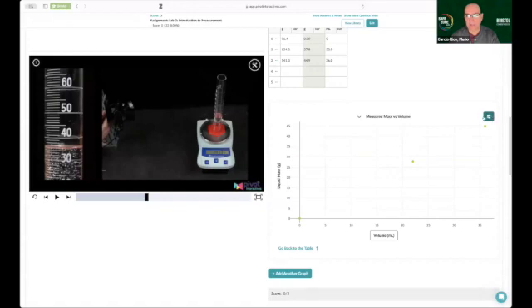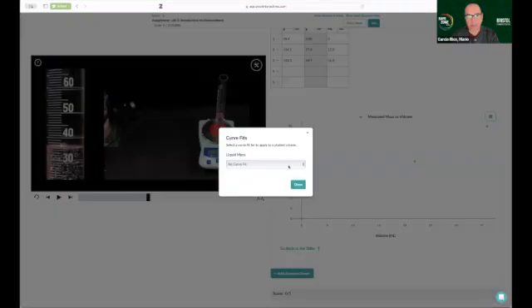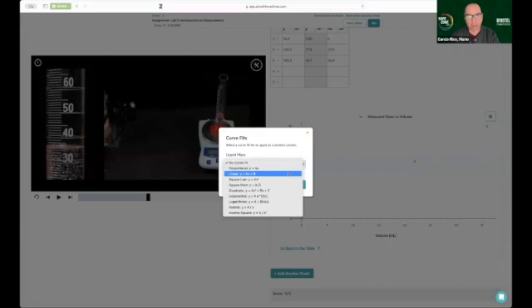If you click on this gear, you get this menu where you can actually select something called curve fit or curve fits. If you click on that, you're given the choice to create a formula that applies to that graph. And we're going to choose the linear formula. This is the equation of a straight line. y equals mx plus b. In this case, the m, which I refer to as the slope, is actually labeled a. So a is the slope, m is the slope in the way I learned this equation a long time ago.